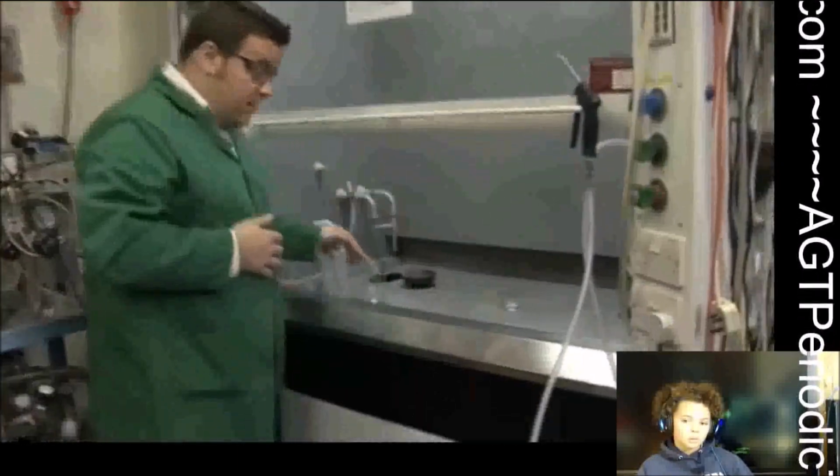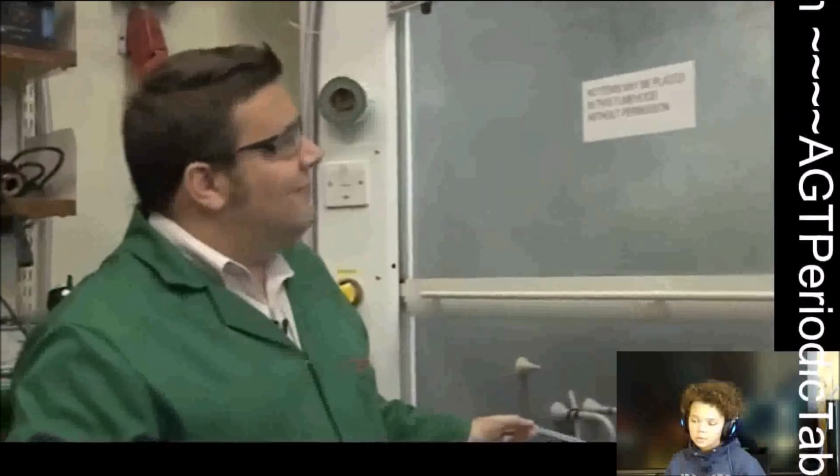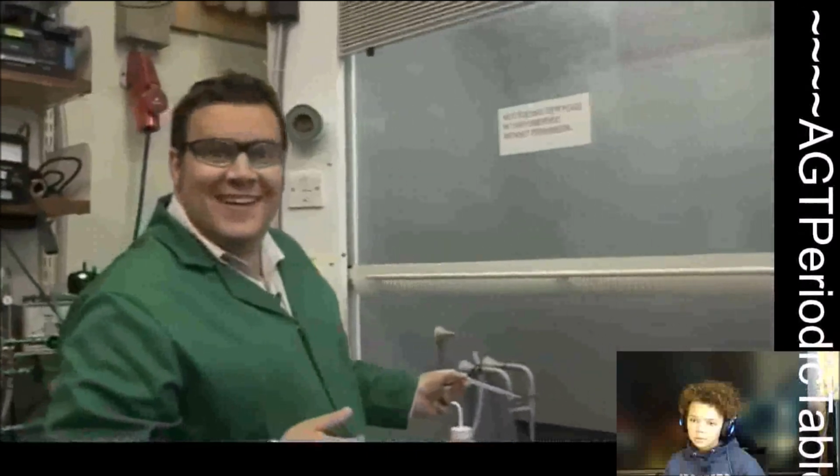So our reaction's ready. Now all we need again is a little bit of water just to start it off. Did you catch that? I managed to close my eyes this time.